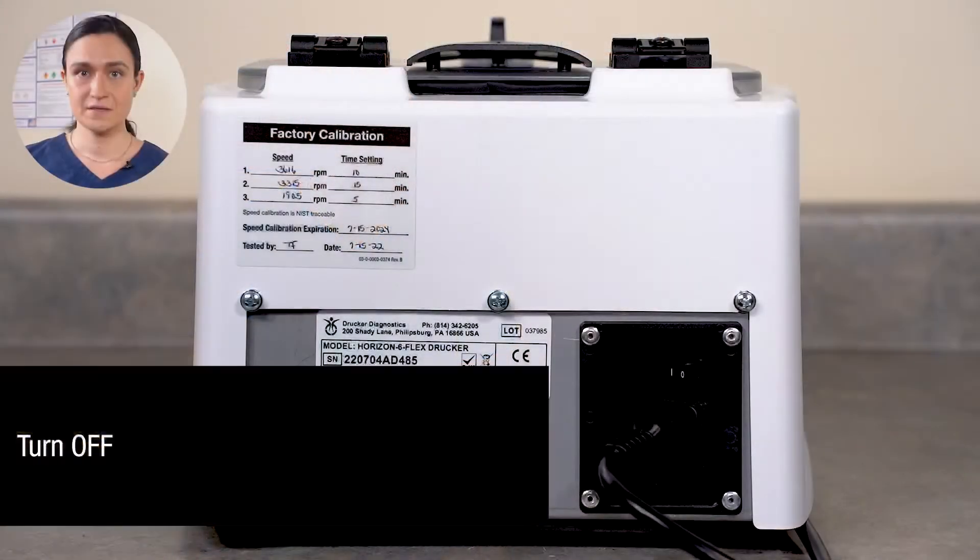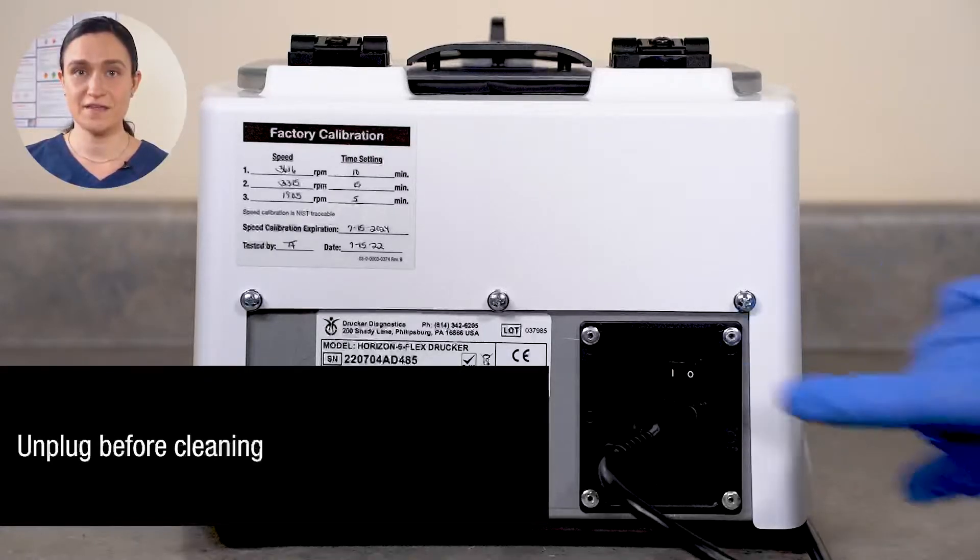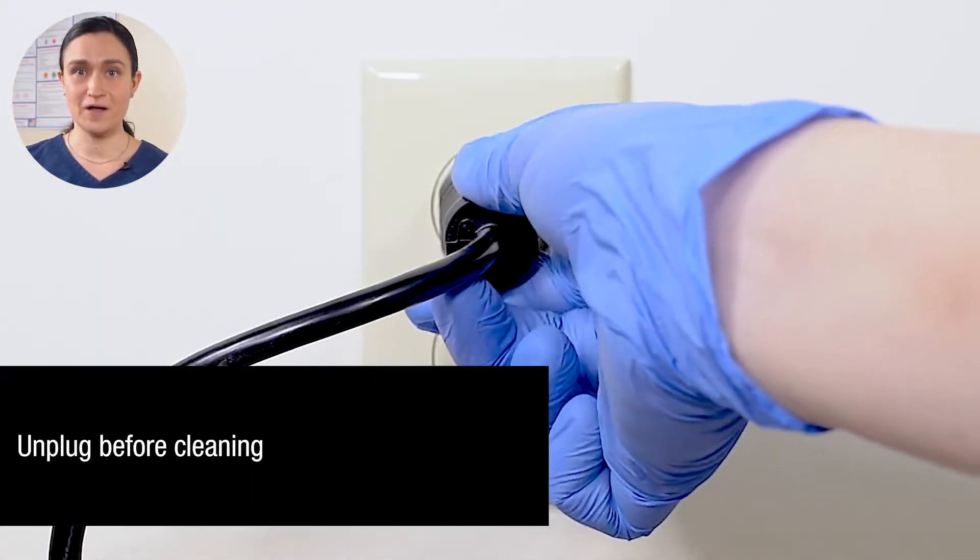Your Horizon 6 Flex requires no regular maintenance. Cleaning is easy too. Start by turning your Horizon 6 Flex off, then unplug it from the wall. Your centrifuge should always be off and unplugged before you do any kind of cleaning.